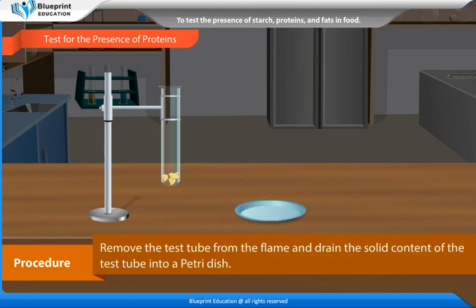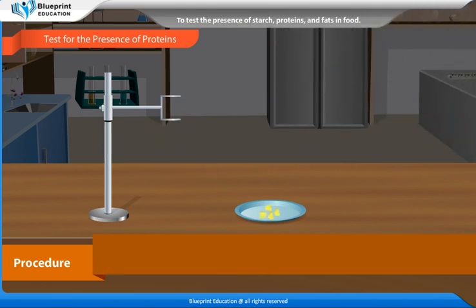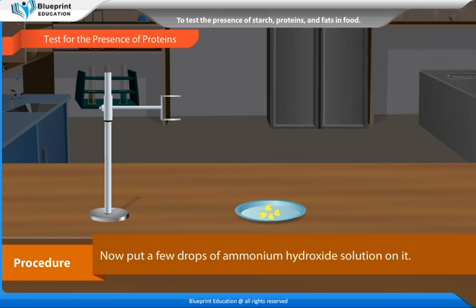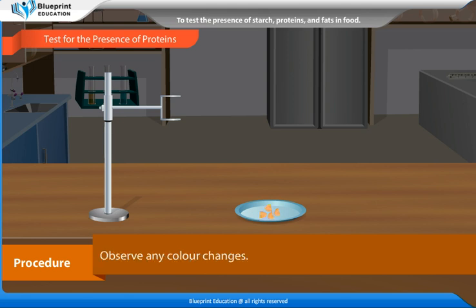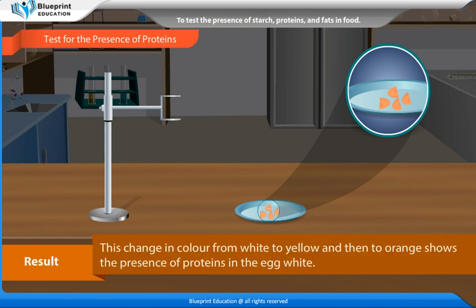Remove the test tube from the flame and drain the solid content into a petri dish. Now put a few drops of ammonium hydroxide solution on it and observe any color changes. Observation: The color of the egg white changes to yellow on addition of nitric acid, and then to orange on adding ammonium hydroxide. Result: This change in color from white to yellow and then to orange shows the presence of proteins in the egg white.